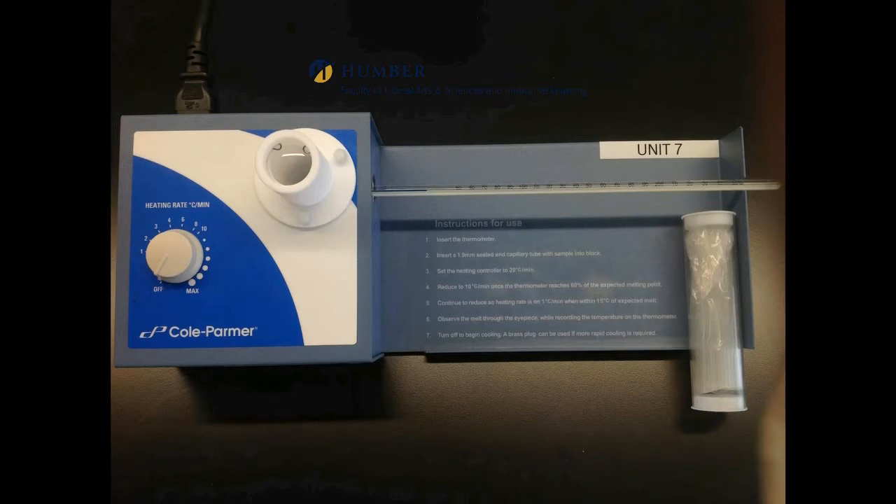This is the top view of the Stuart analog melting point apparatus. Melting point of three samples may be measured at once. Place the samples in a capillary tube and insert it into the aluminium block, which is located at the side. Using the dial switch, set the heating rate around 5 degrees centigrade per minute.